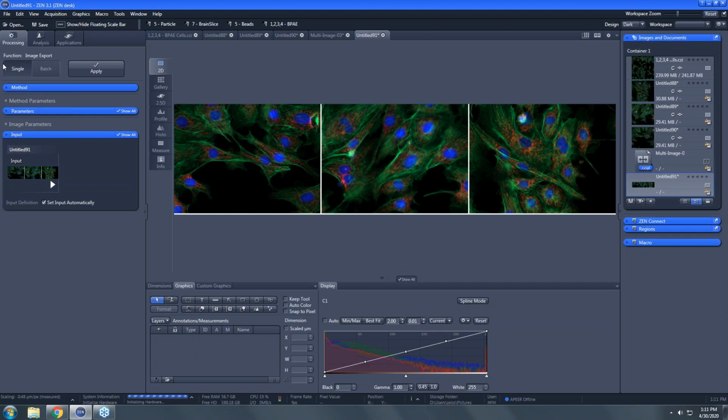And we're going to do that later on today with some of the image processing we do. Good. Great. That looks awesome. I know I've spent way more time than I needed to in PowerPoint trying to make everything equal. So yeah, this is really handy.